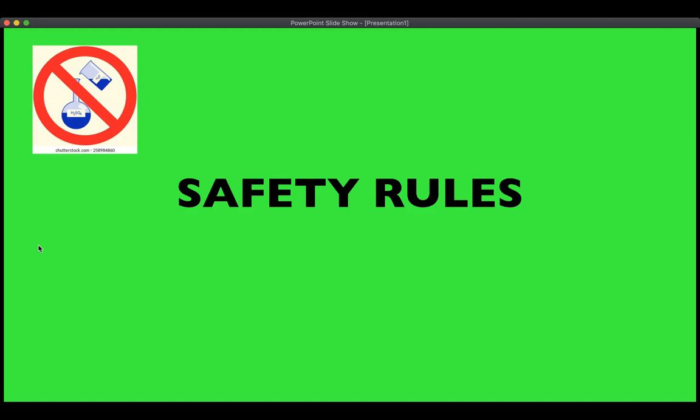Then, after each explanation of the lab in the manual, they give you a couple of calculations, a couple of tables you have to fill in. Copy the tables in your lab notebook, okay? So during the lab, when you conduct the experiment, you are going to fill in the lab notebook plus the lab manual, okay? After you're done, you are going to rip the pages.